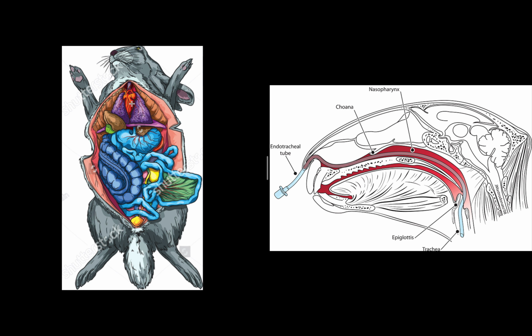This bronchus, which is further divided into smaller branches called the bronchioles. The smallest ends of the smallest bronchioles end in tiny air sacs called the alveoli, which inflate during inhalation and exhalation.